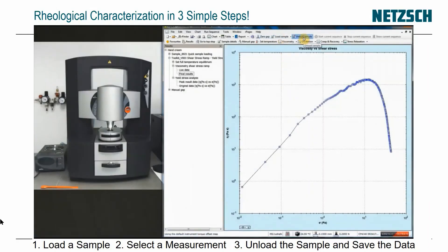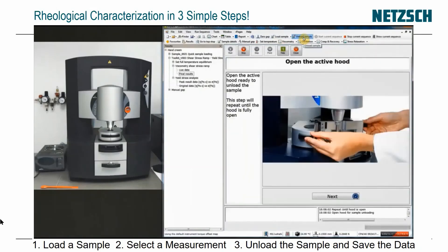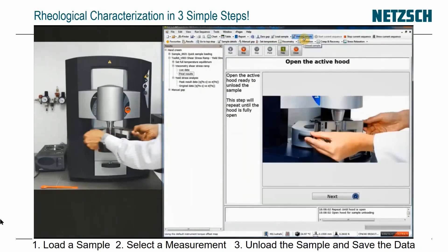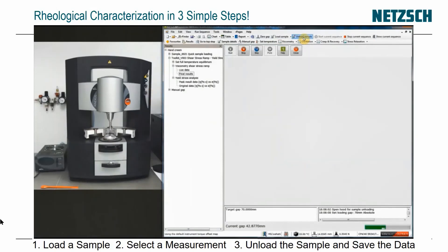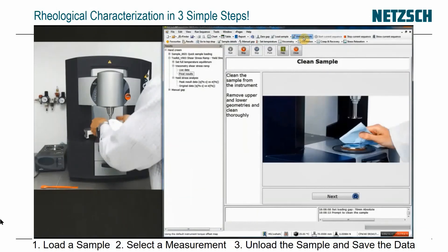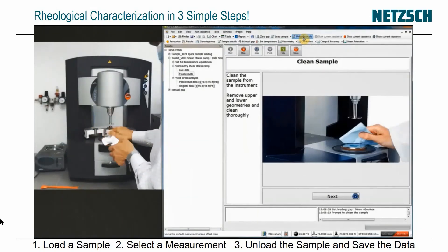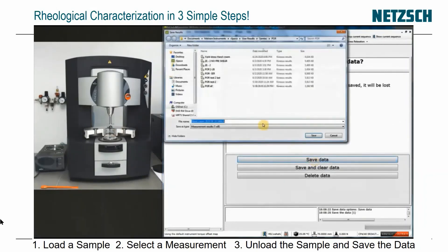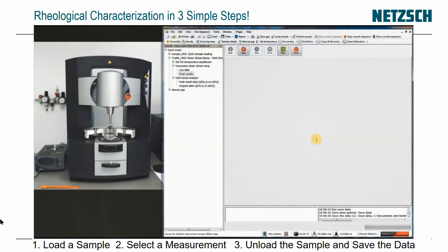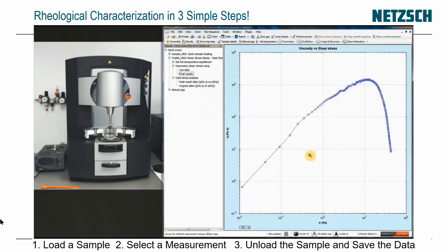Now I just need to unload — this is my third step. I click Unload Sample. It says to open the hood; I open it and click Next to open up the gap. Now it's asking me to wipe the sample clean, so I wipe off the upper and lower plates. I click Next and it asks if I want to save the data. I click Save and it comes up with the name 'hand cream' with the date and time. And I'm done.